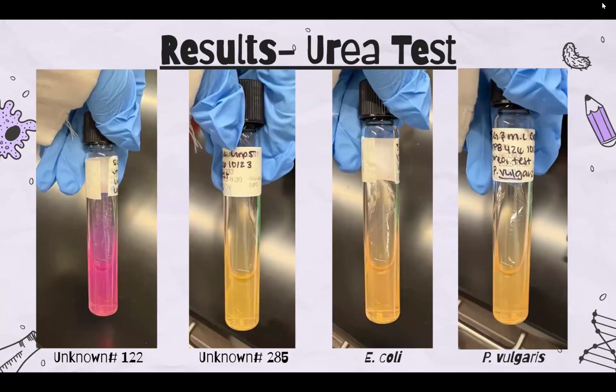Now we go into our results, starting with the urea test. So as you can see here for our E. coli, there was no color change, indicating that it was negative. For our P. vulgaris, there is also no color change, indicating that it was negative. Now for our unknown number 285, there was also no color change, indicating it was negative. The one that had the major difference was our unknown number 122, which completely turned the whole tube pink, indicating that it was positive, that urease was present.